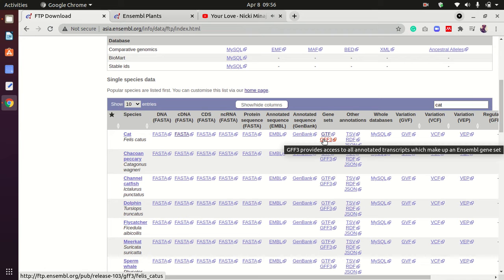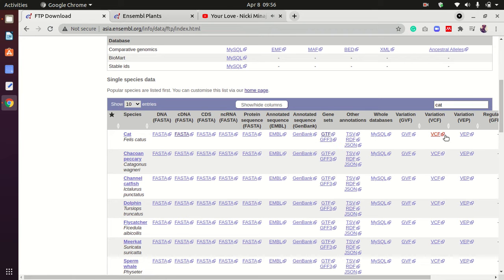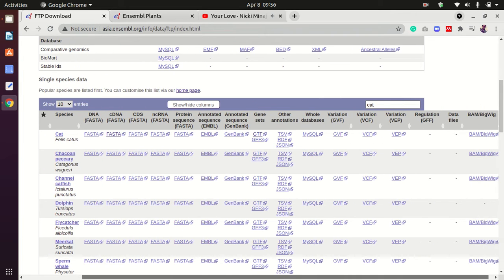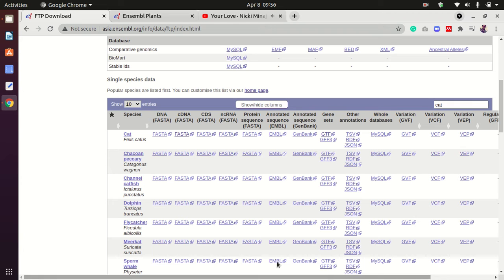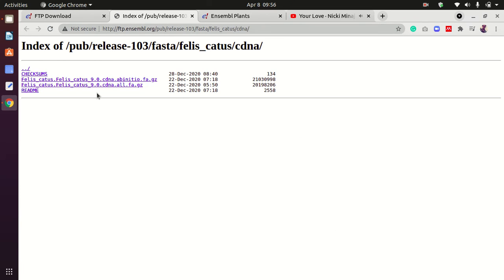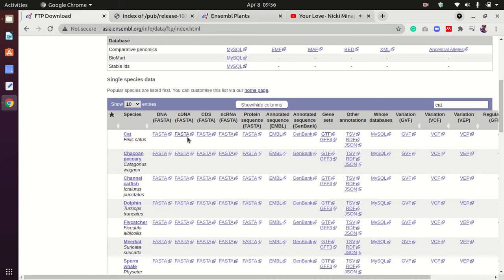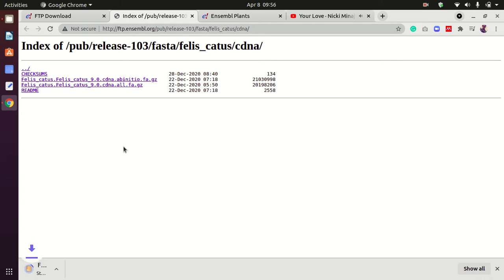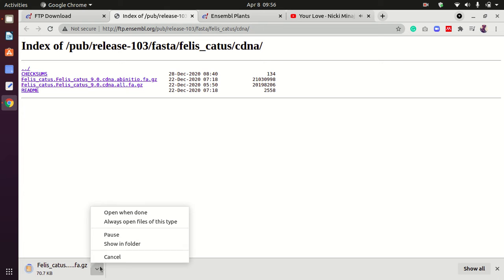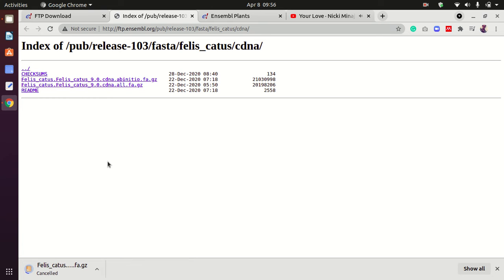If you want to download the cDNA file, just click here. I'm going to download the file. I already downloaded this, so I'll just cancel it.